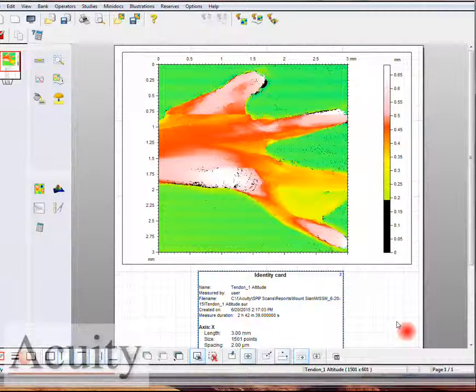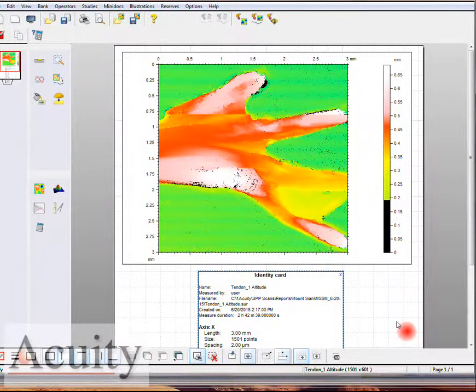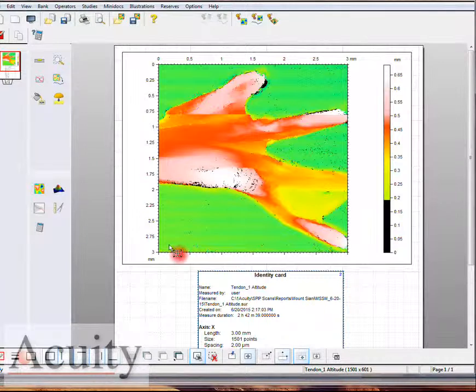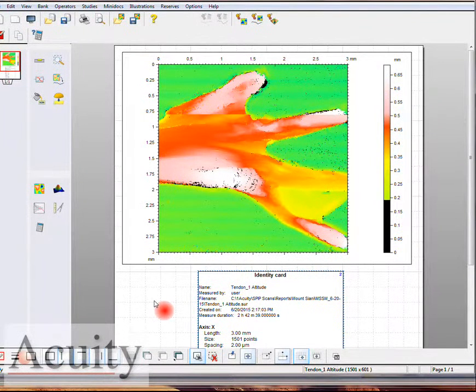Just to give a really rock solid proof of concept. As you can see in some of these images, this scan was about 2 hours and 40 minutes, so way too long. But we just wanted to collect a lot of data. The target did appear to dry out a little bit after about the first, well I'd say roughly an hour.